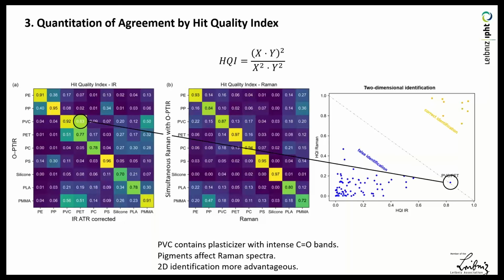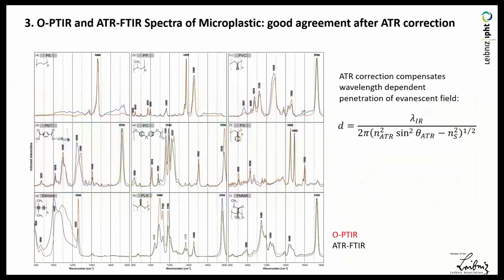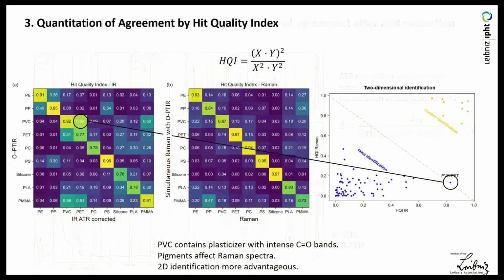However, PVC contains plasticizer to make it elastic, so and this is why the carbonyl band is present. So here again is PVC, that's the structure, there's a chloride band, and then the rest is hydrocarbon, and still we have this strong band, which is unexpected.